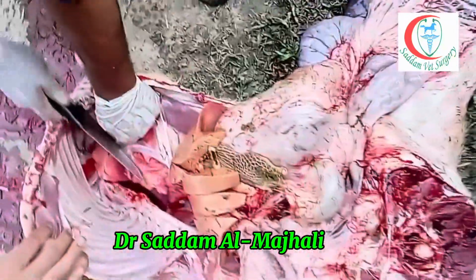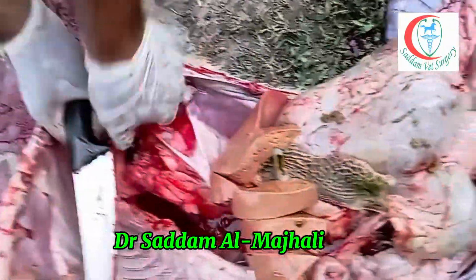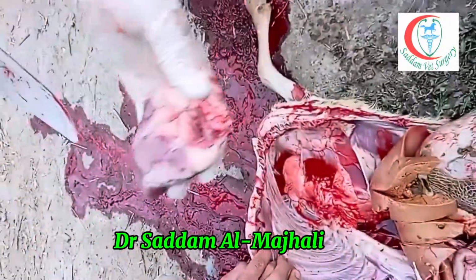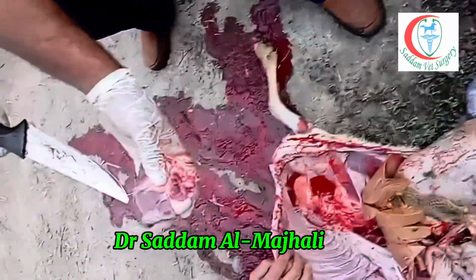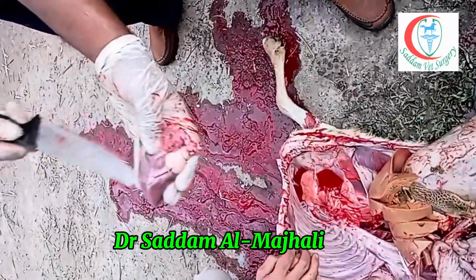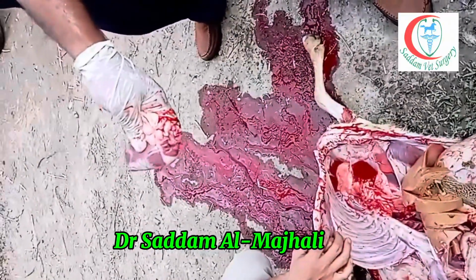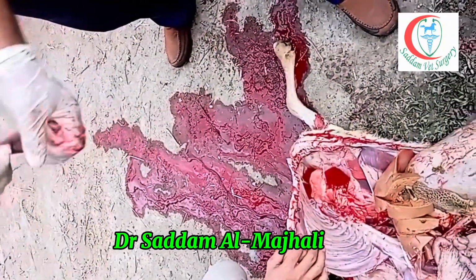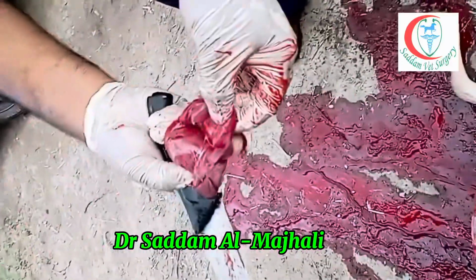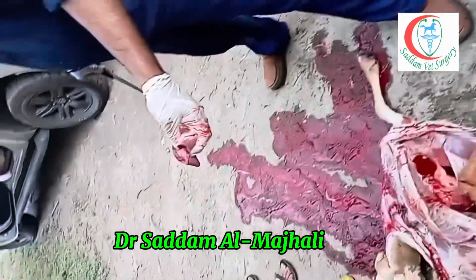The heart, I can open the pericardium. See, that's why she died. The heart muscle is not strong enough. Normally when we cut the animal, you remember, did you see the heart before? The heart should be strong, yes, like eggs. But this one, she collapsed. That means the muscle is very weak. No nutrition. I see the muscle also very weak, but nothing inside. Still healthy, but very weak because the animal had a long time no eating.